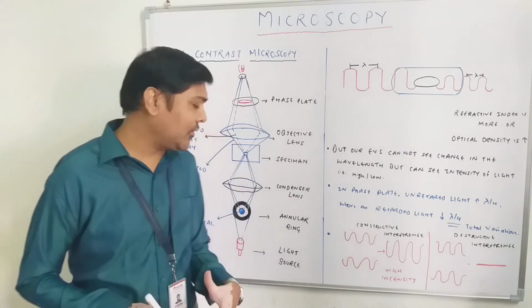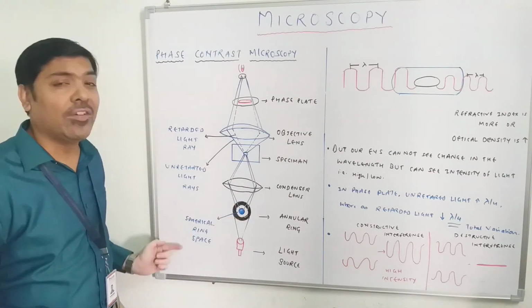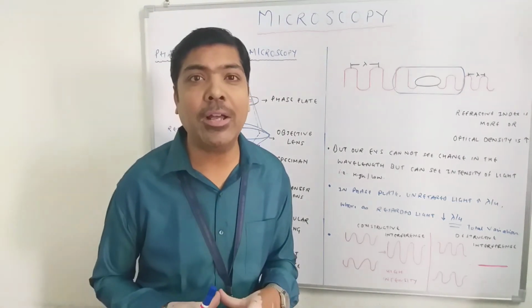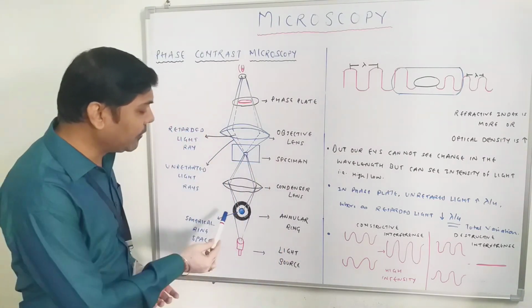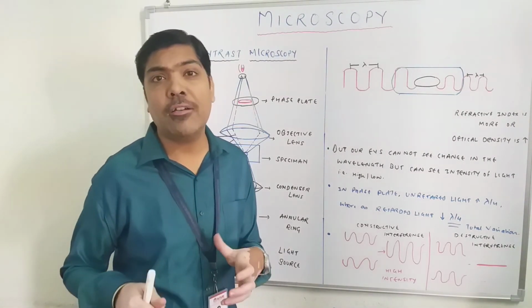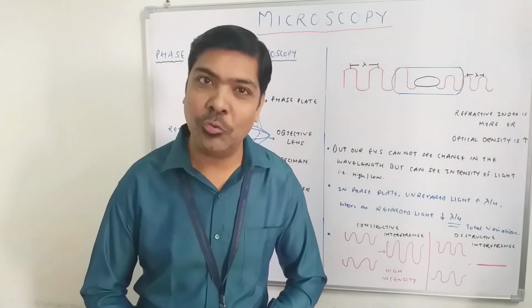As you can see in this structure, some hollow spaces are available that form a circular ring space. So in that ring, some space is available that can permit the light to pass through it. Otherwise, whatever solid structure is available in the annular ring will not permit the passage of light through it.